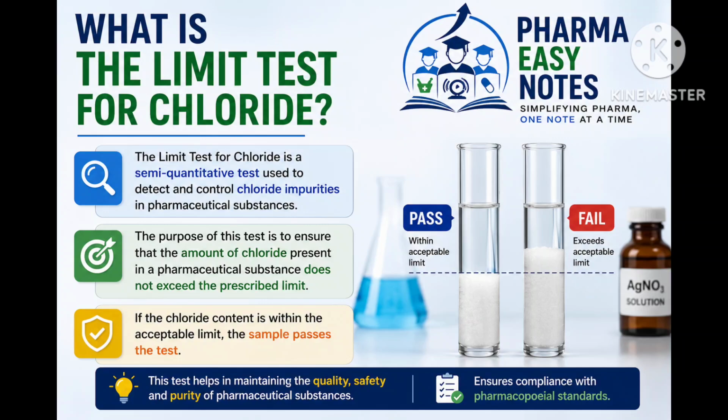In today's lecture, we are going to discuss an important topic from Pharmaceutical Inorganic Chemistry, limit test for chloride. This topic is frequently asked in university examination, practicals and Viva. By the end of this lecture, you will understand what is limit test for chloride, principle of the test, chemical reaction involved, procedure, interpretation of results, important Viva questions.